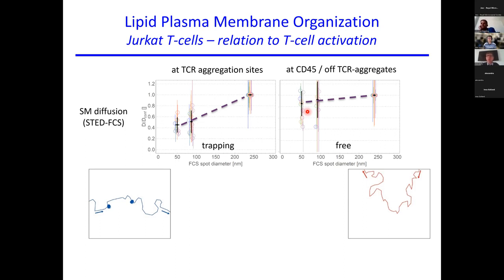Okay, thank you very much. That's very clear. So in this instance, you do need an STED-FCS instrument to see this effect, isn't it? Yes. But just like a normal confocal machine, you can equip it with the right detection electronics, which is usually single photon counting. And with single photon counting, you can do FCS, and that's it.